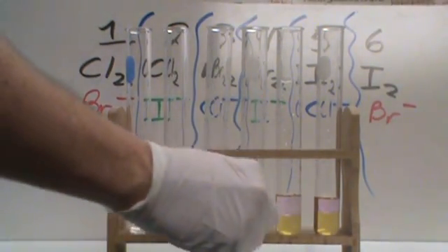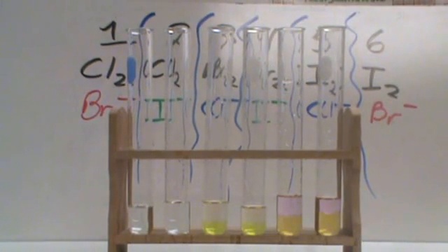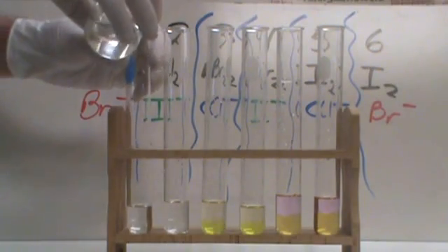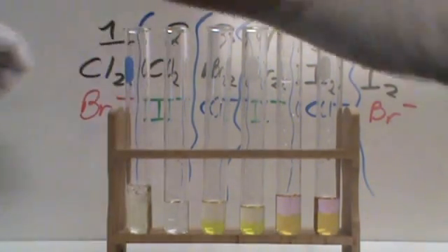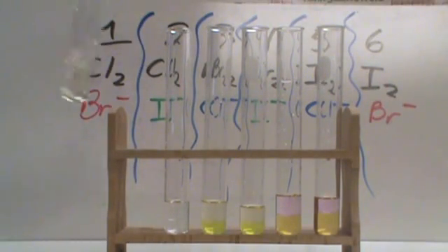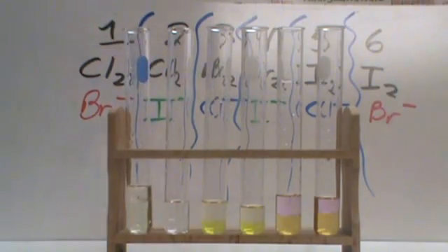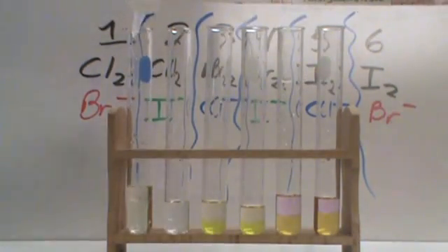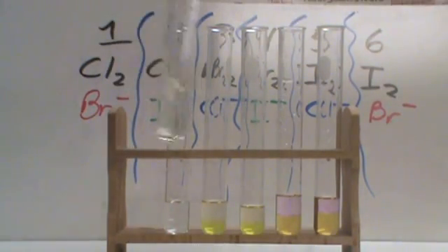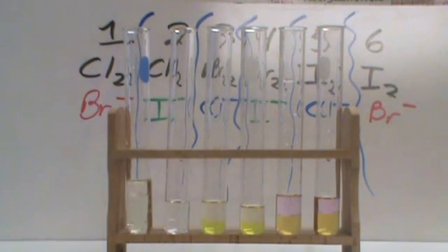This is chlorine in both layers, bromine in both layers, and iodine in both layers. Now I'm going to mix halide salts in. If it reacts, we're going to see a color change occur. We're going to put bromide ions with chlorine gas here. When we do, we see a color change start. I'm going to beef that up a little bit to really get that color to pop. Now you can see this is no longer completely clear. What we're seeing is the formation of bromine.